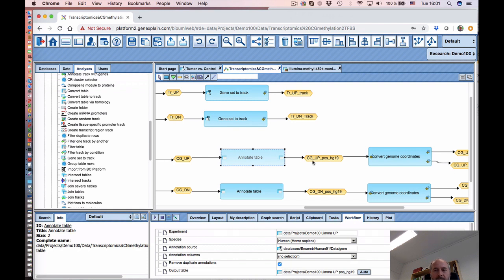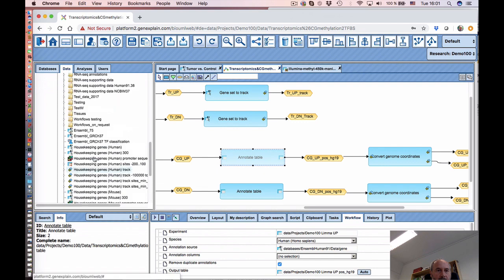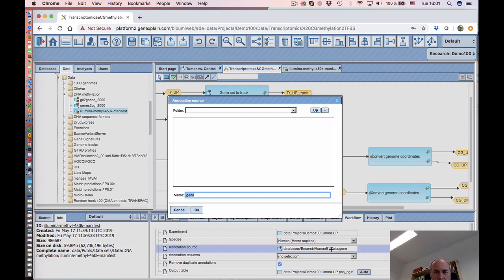As we know, it is in this table which is already prepared and in the public repository. So here we had a look. We have to add this table to this folder. So we need to simply add the URL of that table here into this folder.